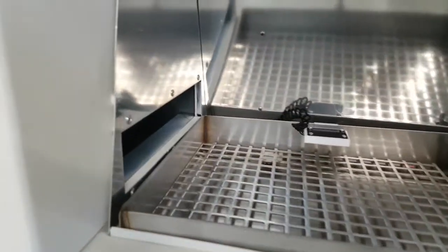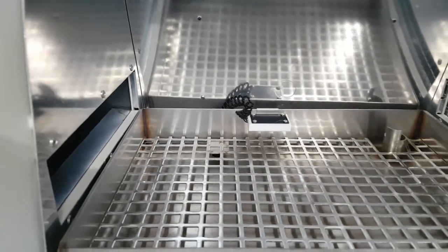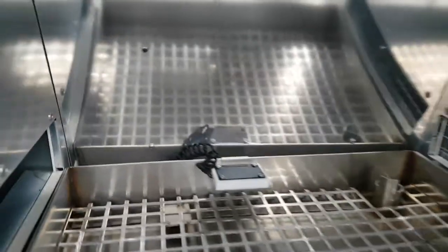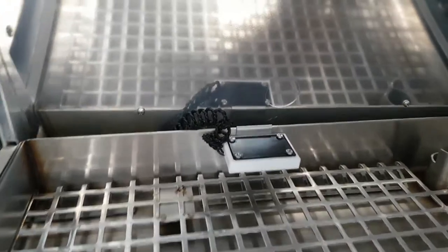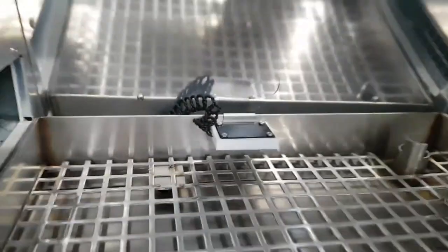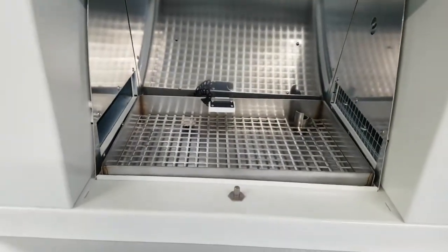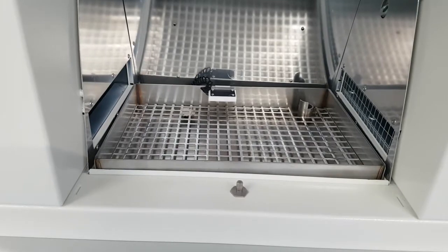Inside the chamber, you have the grid and the exposure tray. The grid is for the flooding system.